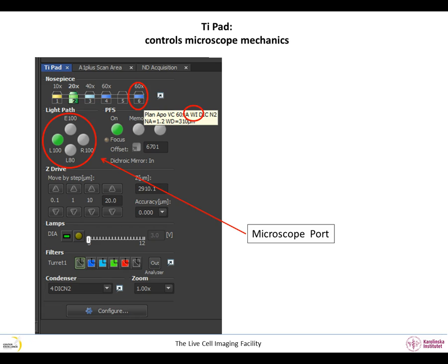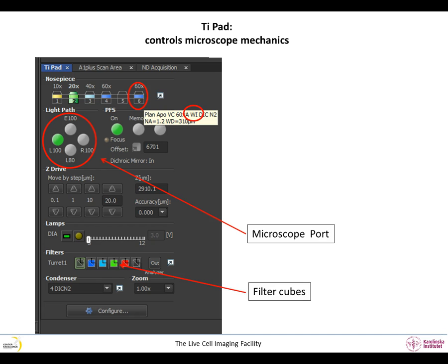In the TI Pad tab, you can see the microscope port to which the light goes. This is set automatically by the software. E100 means 100% of the light goes to the eyepiece. L100 means 100% of the light goes to the confocal port. R100 means 100% of the light goes to the camera port, if the microscope is equipped with a camera. The TI Pad also allows you to change filter cubes if you are looking at fluorescence in the eyepiece.